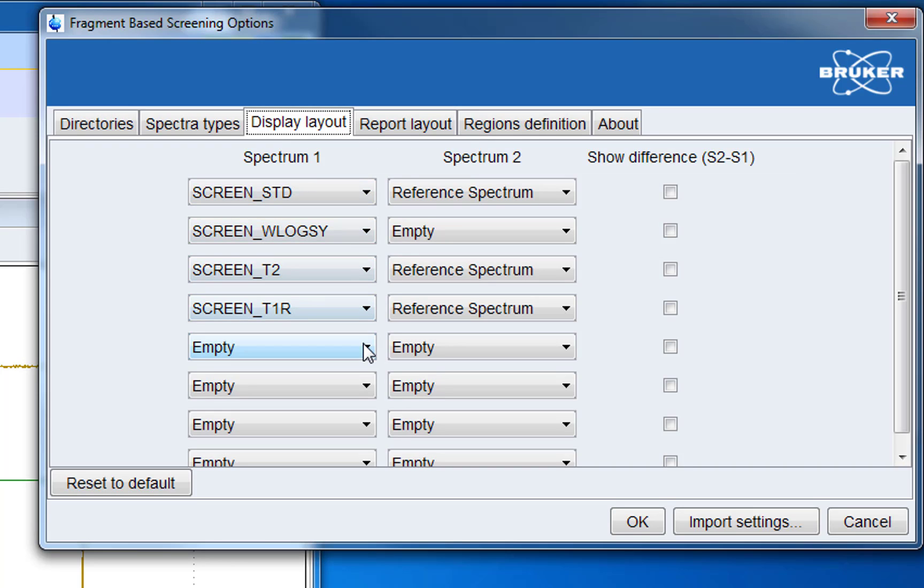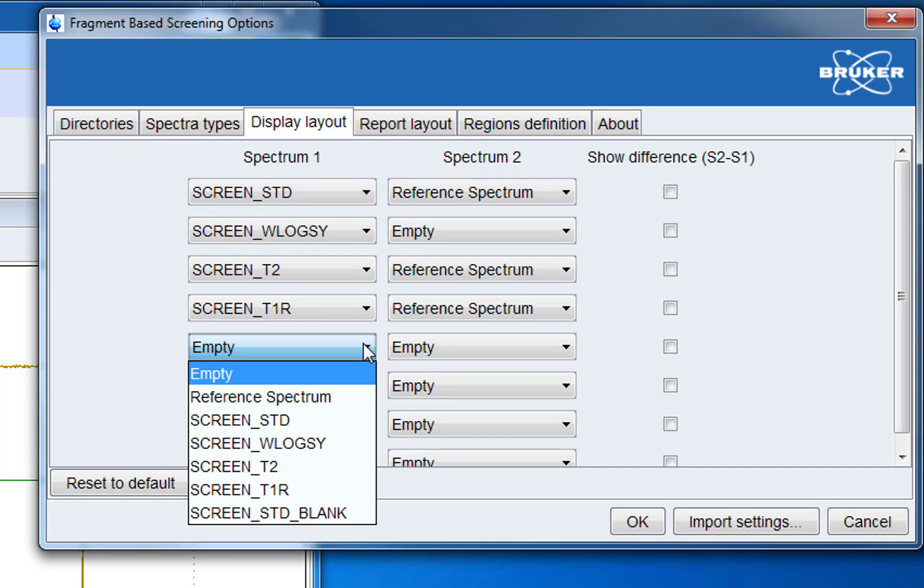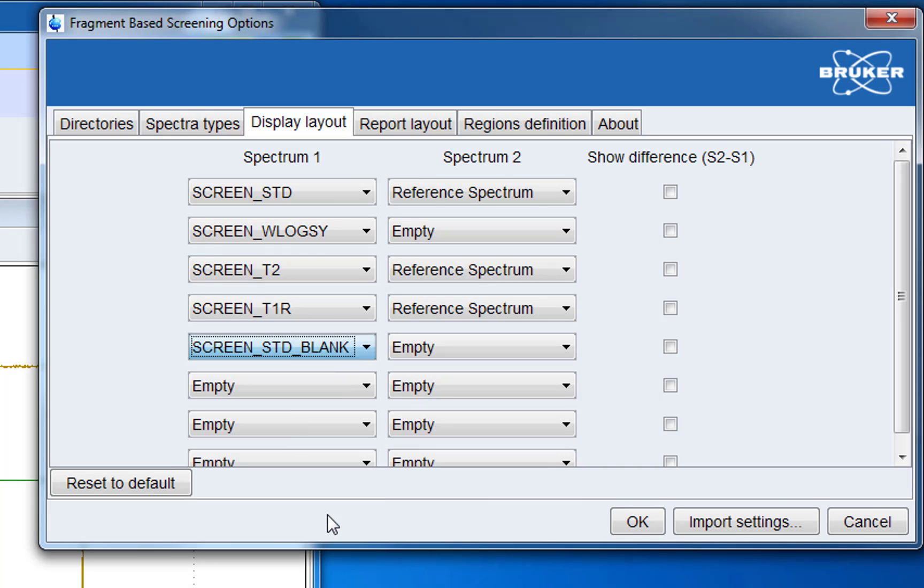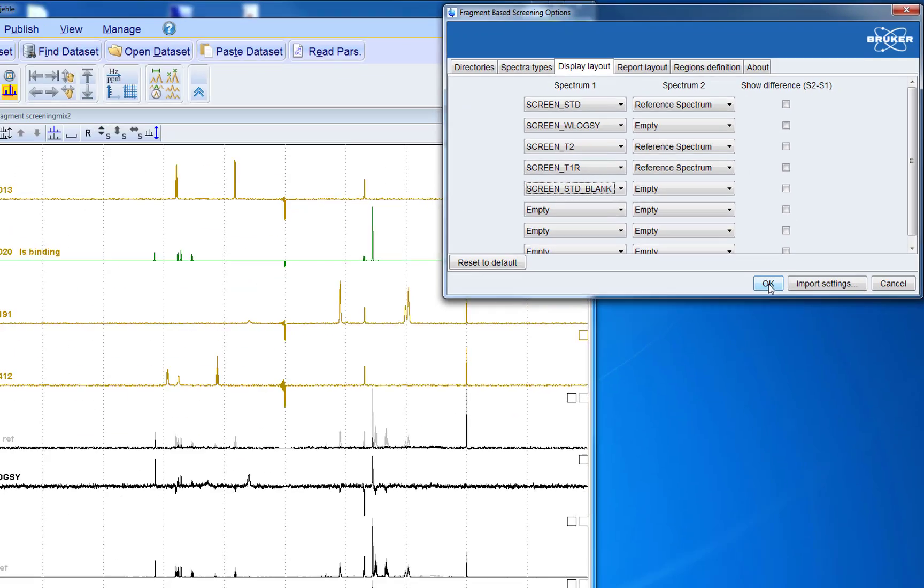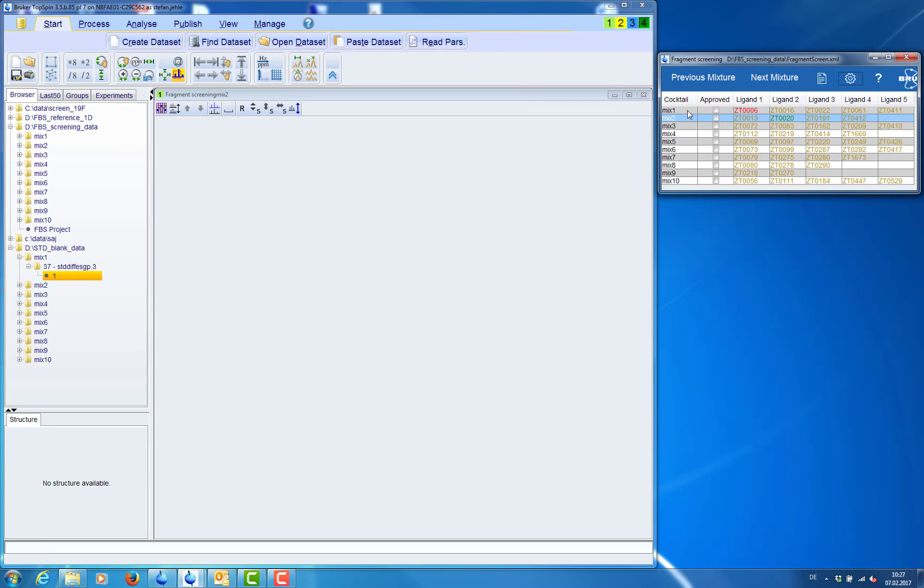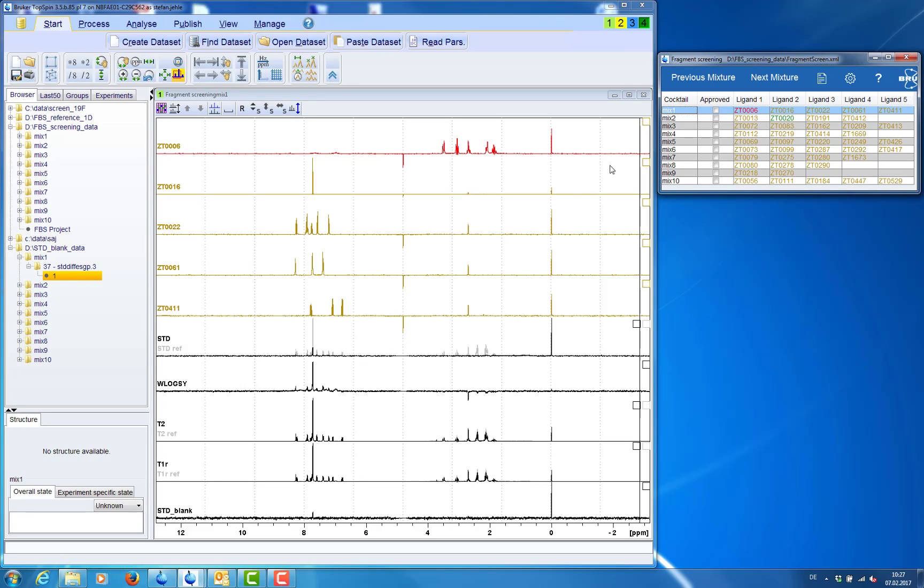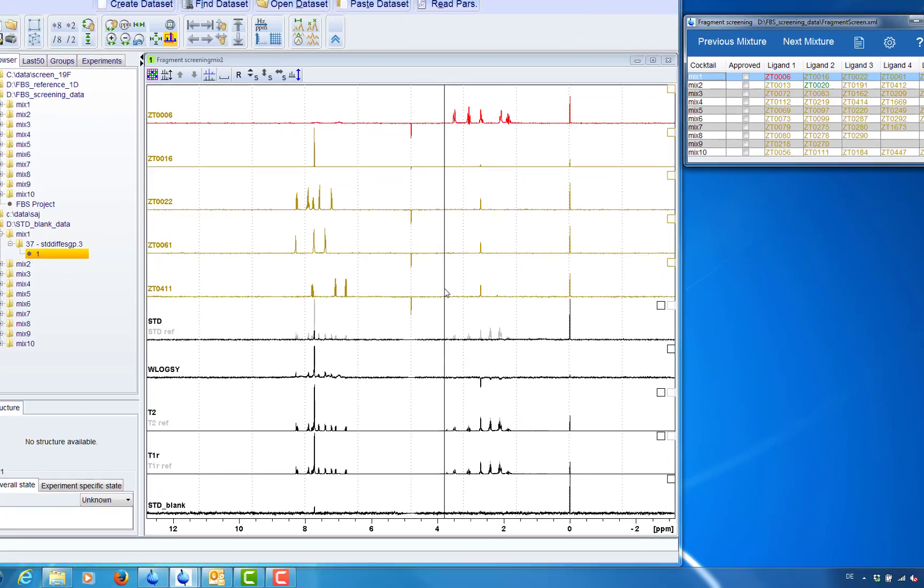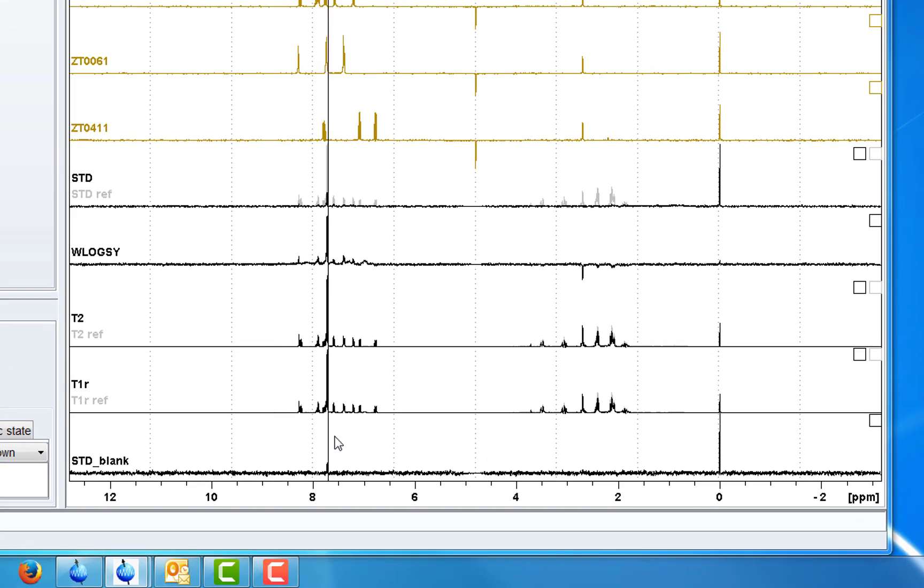Now from the pull down menu we add the new spec type to the display layout. Now we add it to the bottom. And after clicking OK and refreshing the view we will see that it will appear at the bottom of our display.